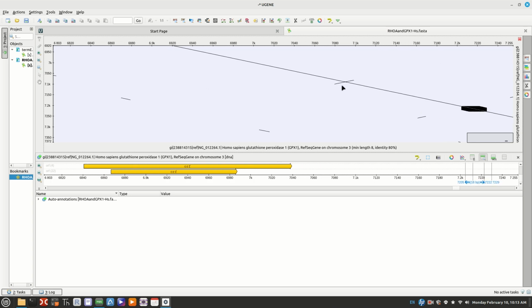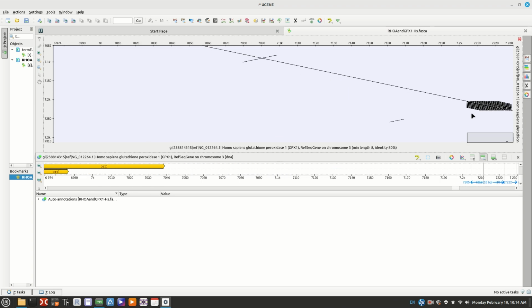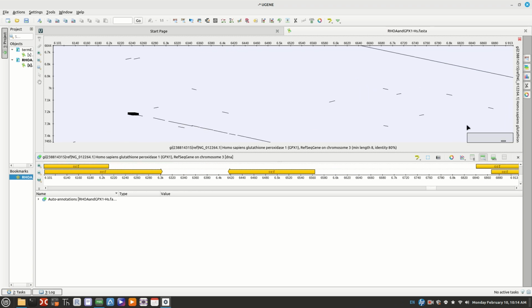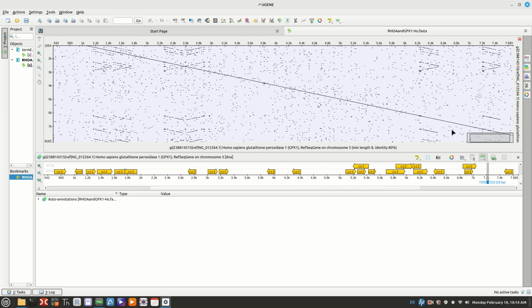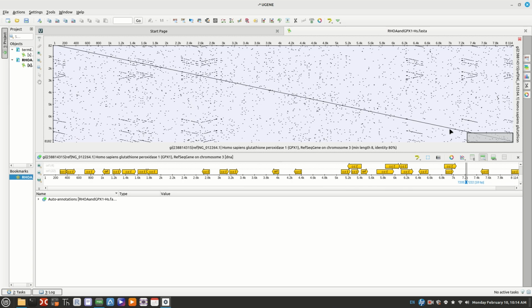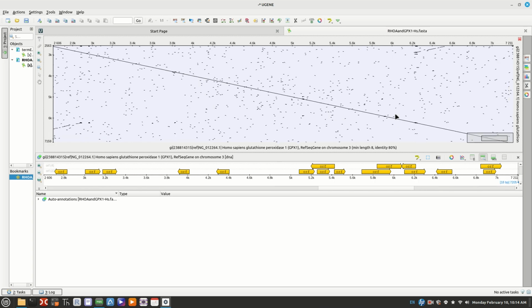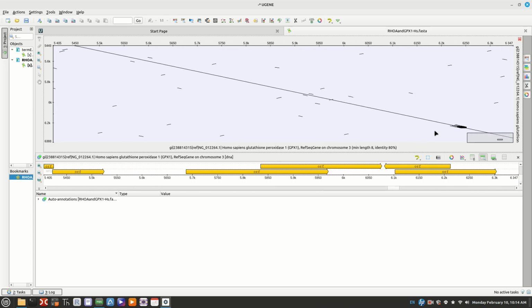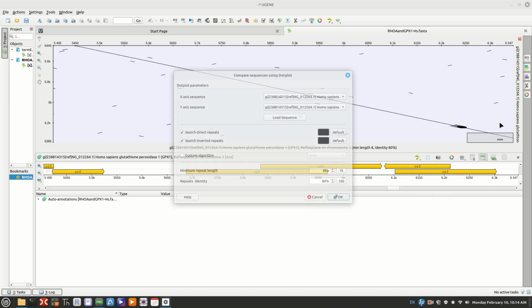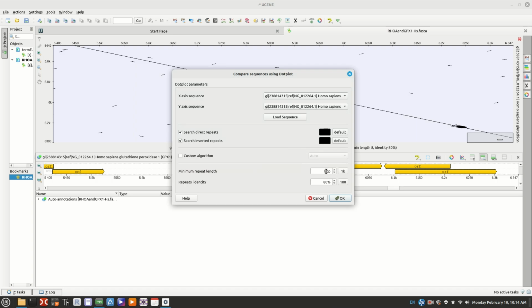But we lost our view of this over here. This just may be a lot of letters of the same sequence. But you would expect at the end of this gene, which is between 6 and 7,000, a terminator, and you can look for some little crosses there. Yeah, at this point, I would say you're turning in this assignment. Those crosses there that we just had would be sufficient for you to say, well, that's the potential terminator.